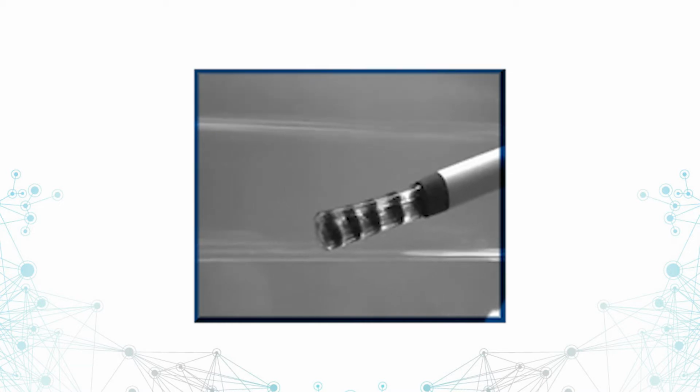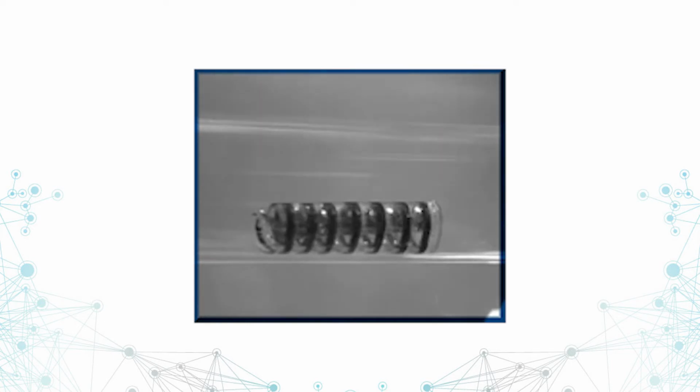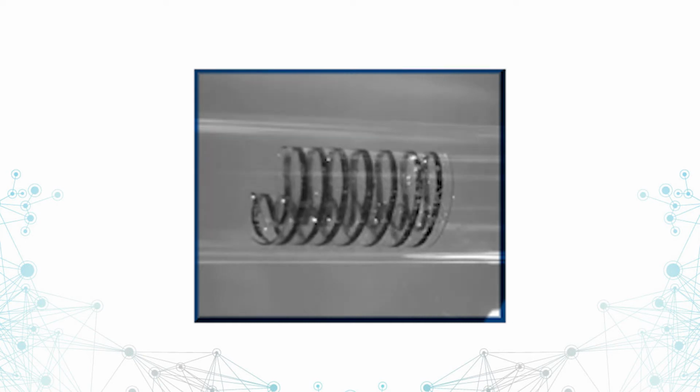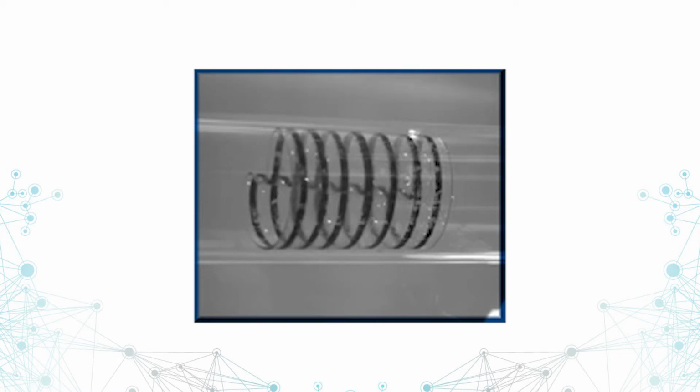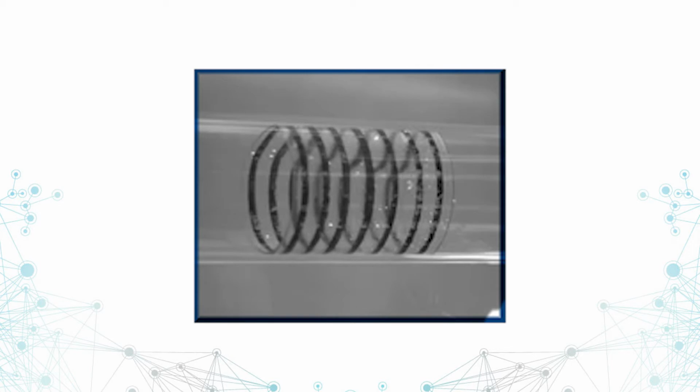Another example that we could use is for minimally invasive surgery, or stents. And in this case, there's a catheter here. I think it's a 22 French catheter. We packaged up a shape memory polymer, rolled it up and inserted it into that catheter. We pushed it out, and again, we drew black lines so you can see what's going on. But as it heats to body temperature, you'll see that it unfurls and expands out. So it starts in its package shape. It was around 6 millimeters in diameter, and it's going to expand out to about 22 millimeters. So you can see for minimally invasive surgery, you could go in through a very small hole and then expand a device once you're in the place that you want to be.